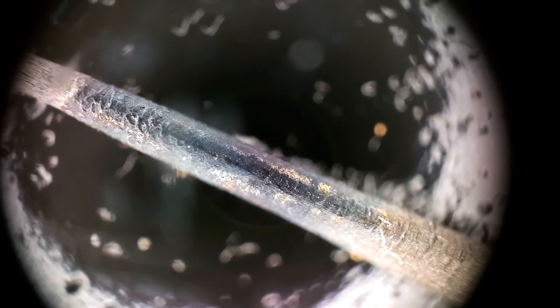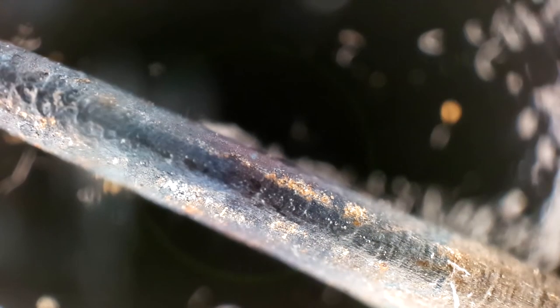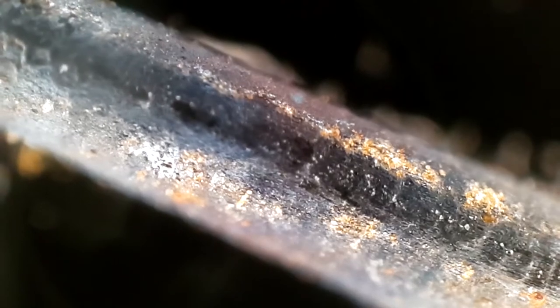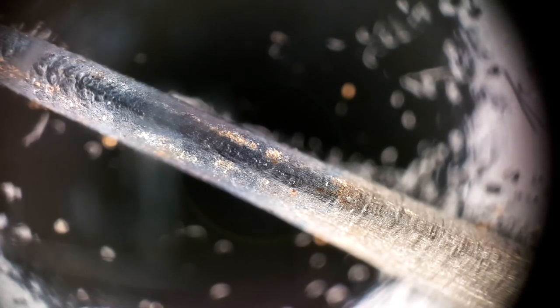Again, a little bit further down, moves away from sort of wavy to a kind of flattened surface, but it's never quite flat when you look at it close. See along the edge there, it's a little bit wavy. Real close up on this section here in the middle. Shifting focus. Again, just sliding slightly further down.